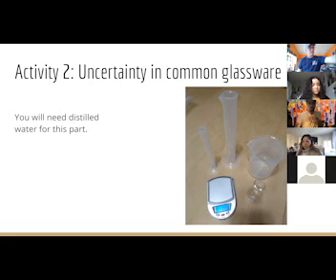So you take it out, and obviously do not grab the thermometer by the bulb, because that will heat it up. Grab it from the top, and then you get level with it, and you try and give your best estimate of what you think the temperature is.